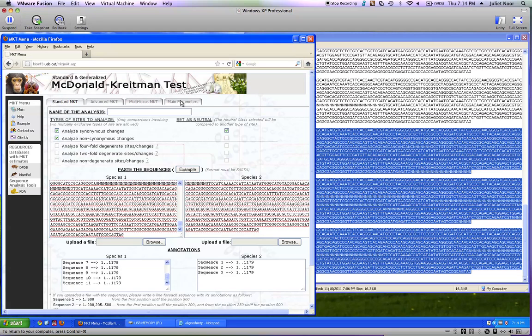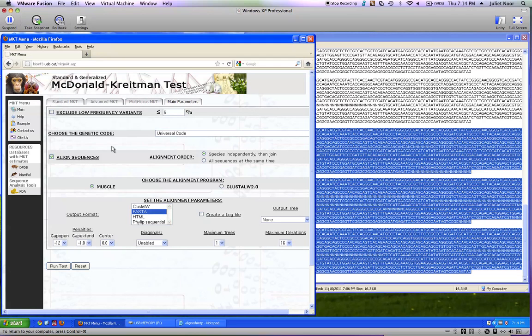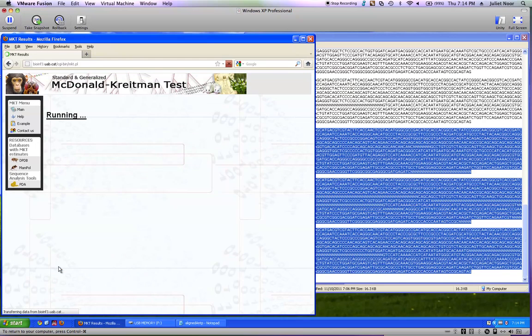But before we can run it, we need to go to Main Parameters. We already aligned the sequences, so we don't want that to happen again — we want to leave the alignment alone. Uncheck the box next to 'Align Sequence', and then click the Run Test button. It thinks for a little bit and says that it's running.